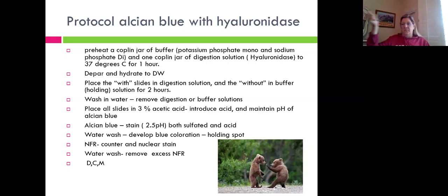Which leads me to, on an off topic, another point. When you start running special stains, I see it every single year, it seems like with new students, you set your timer, and then you're looking at those seconds.